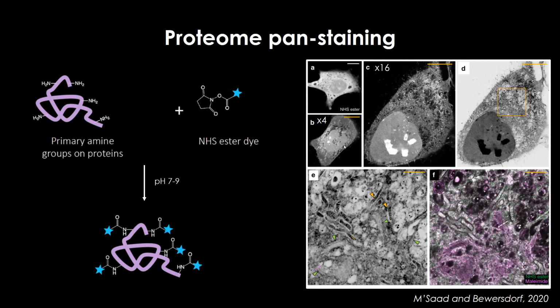We actually applied it also to the 4x expansion, the regular one, after the staining and everything is done, just before the expansion. And here you can see the image of the 16x. You can appreciate how nicely, for example, the mitochondria are visualized using this dye.